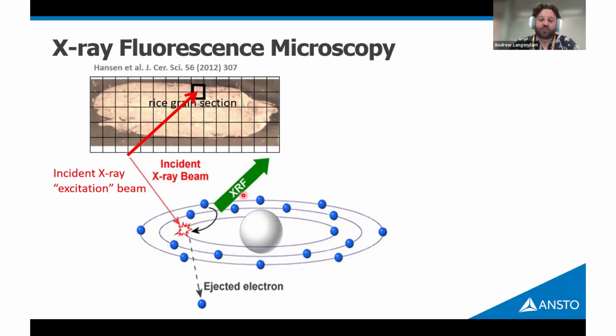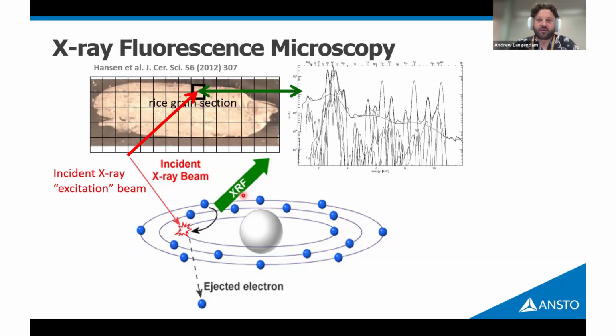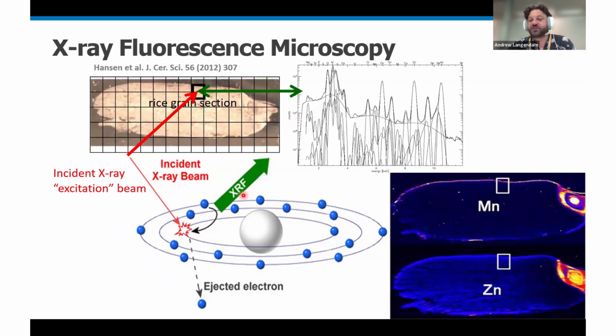So this means that when you look at your spectra, that is, the light that comes off your sample as a result of exposing it to X-rays, you'll get these peaks that all correlate to different elements. And if you do some complicated maths and solve for those peaks, you can work out how much of each element is contributing to the overall spectrum that you're getting from your sample. And this means you can select a particular element and have a map just of that.